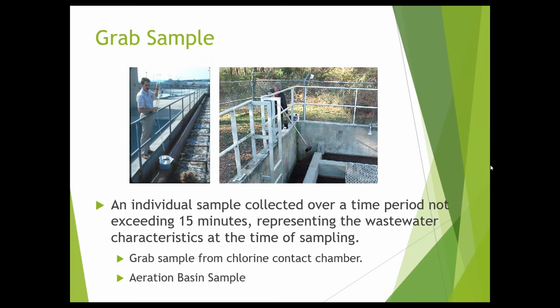I keep the sample event marker turned on with my ISCO sampler to verify the actual flow is happening when the event happens. So what that means is ISCO will give you a readout of if it missed a sample. And so that sample event marker tells the user if it missed a sample or how many samples it missed. And by missing, that means no liquid passed through and was deposited into your container.